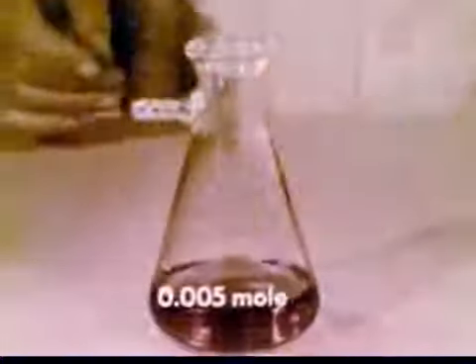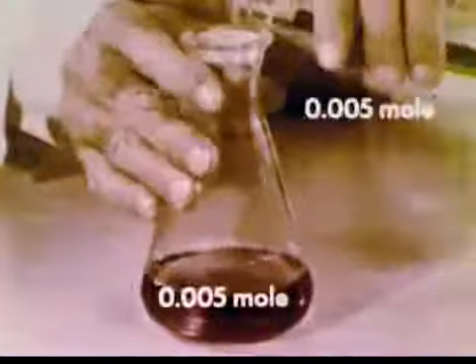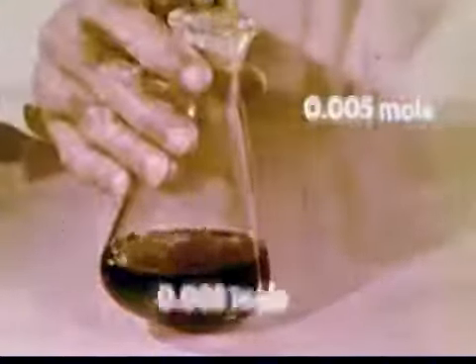Now to our 5/1000th mole of vanadium, we add 5/1000th mole of cerium. The same green vanadium is formed as in the shaking experiments. Oxidation of the vanadium has occurred.